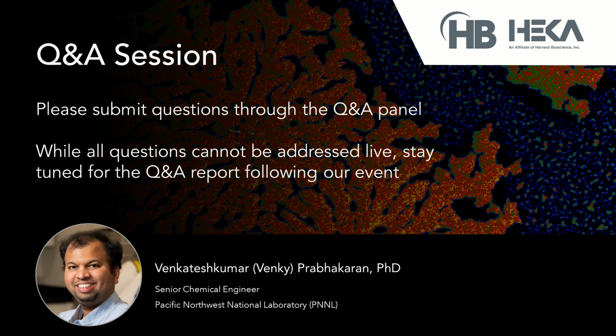Again, it helps in certain applications where you can use a redox chemistry to monitor how the adsorption desorption behavior changes, or the charge transfer kinetics change. I think the second question is about impedance, why the impedance data does not correlate.